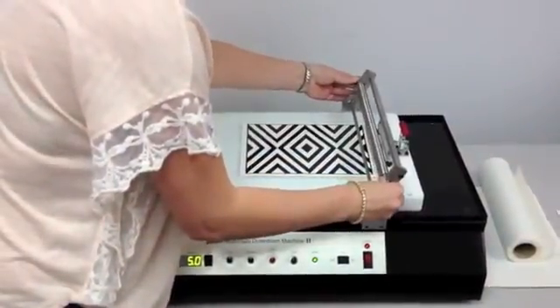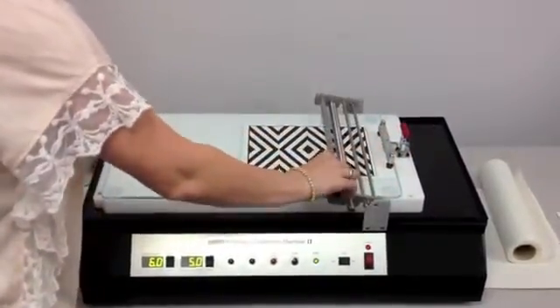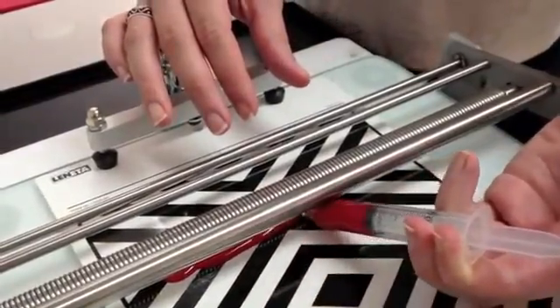Place the applicator in the appropriate position. The rod we are using snaps in on the underside of the drive armature. Dispense your liquid sample at the top of your substrate using a syringe or paint paddle.